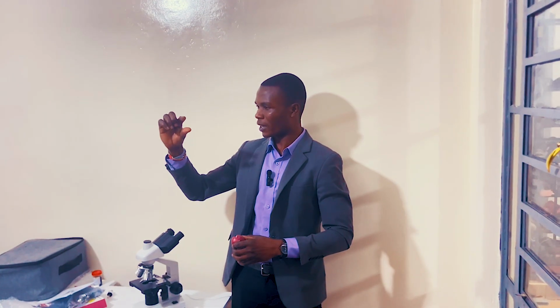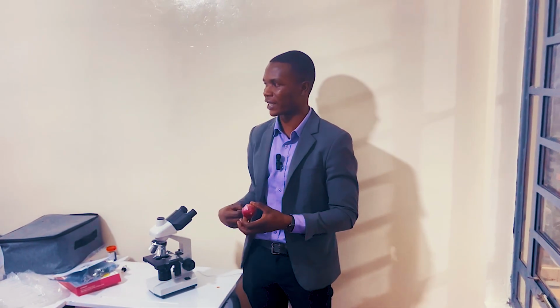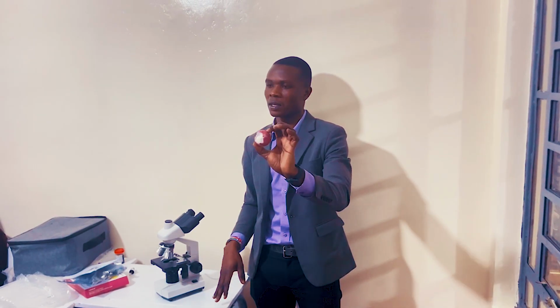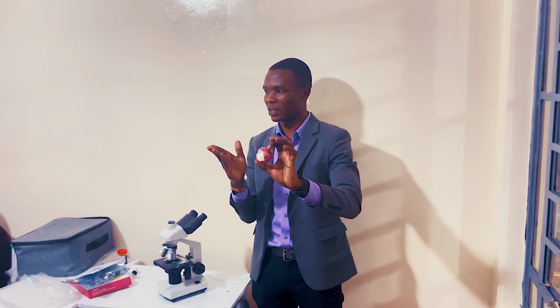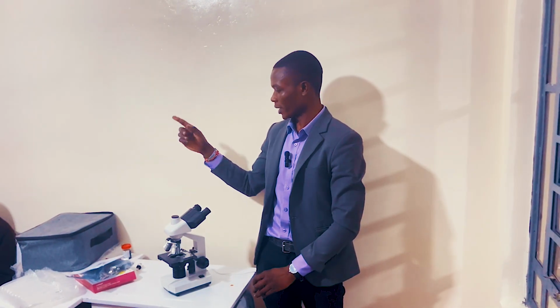Yes, you cut it into, not small, but very thin pieces. You make it very thin so that it allows light to pass through it very well, so that as you are viewing, you'll be able to view all the contents of that cell. Are we together? So the first thing is thinning. You have to ensure that you cut it in a thin layer. Are we together? What do you use to cut?